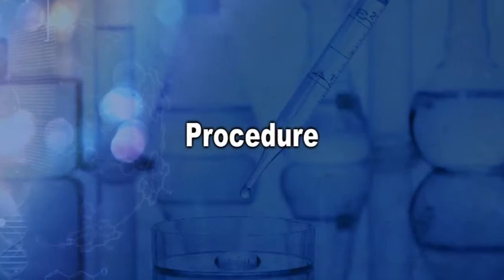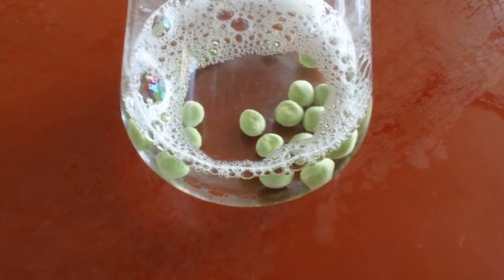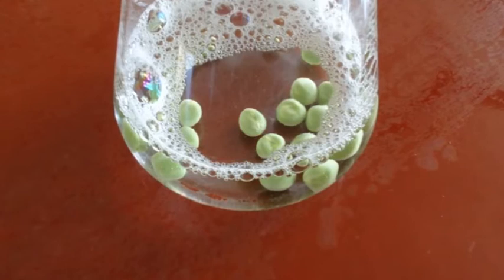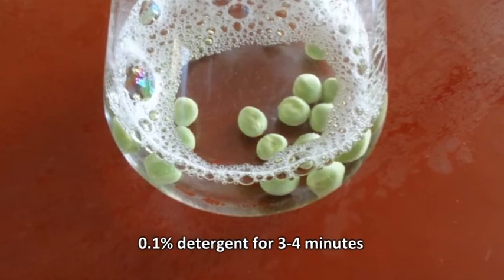Let us see the procedure of the experiment. First, rinse the green pea seeds under running tap water and then put the plant material in a jar with screw-capped lid containing water and wash with 0.1% detergent for 3 to 4 minutes. Gently agitate the content of the jar every 20 to 30 seconds during the washing step.